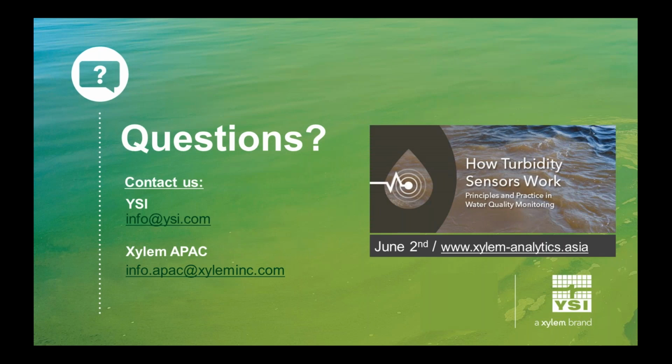However, in that particular application, the total algae PC sensor was actually the one I recommended, because the algae they wanted to detect originated in that river that was flowing into that net pen area. So they wanted to detect a freshwater blue-green algae in their marine environment.